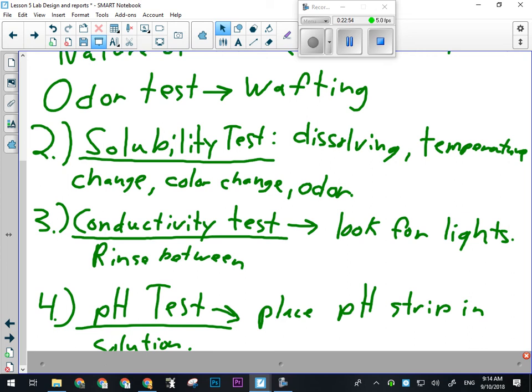Right, so you may want to mention something about how they can tell what the pH is. Compare it to the color chart on the case. So you unscrew the lid. There's your pH strips. They start out orange, but obviously when you put them in different things, they will change color. You don't need a full strip for each material. In fact, one strip should be able to test two materials for sure.